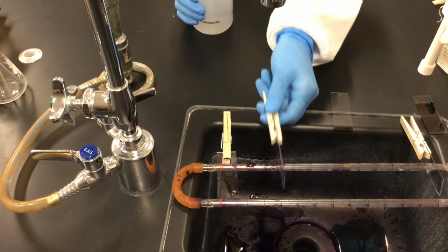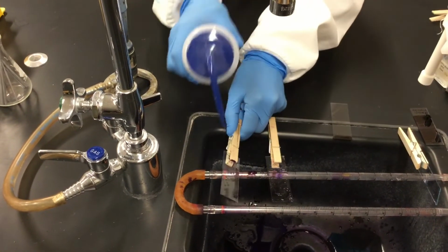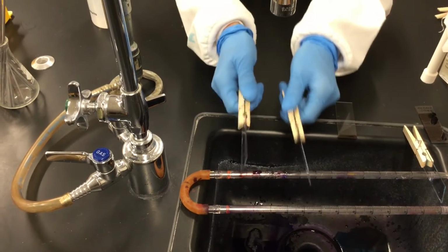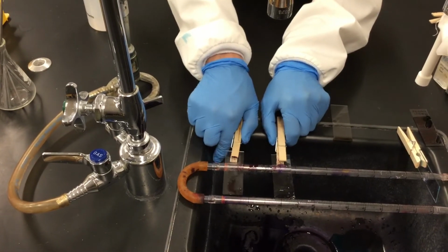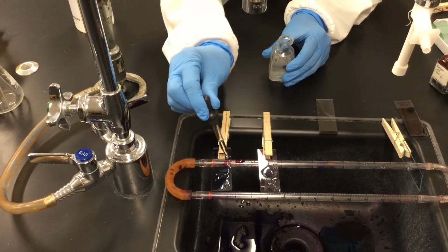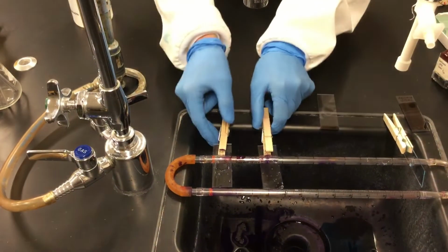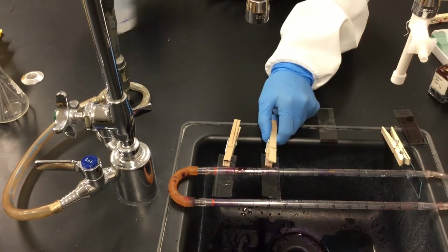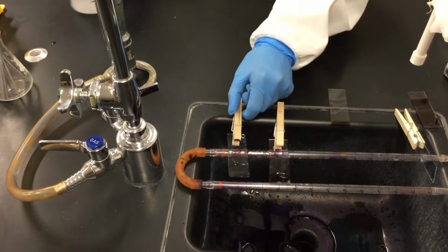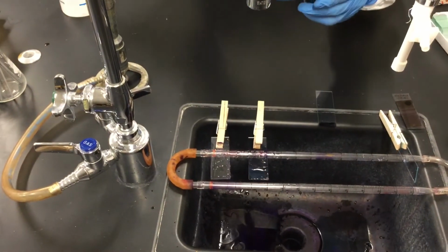So in this case, I check off the excess of iodide, and then again I put it sideways like this, and I start gently squirting water. So there's always a rinse in between the steps of the gram staining. And I shake off the excess of water, and then put the decolorizing agent, 10 to 20 seconds. Then shake off the excess, another rinse. Shake the excess of water, then add the counterstain. 1 minute.